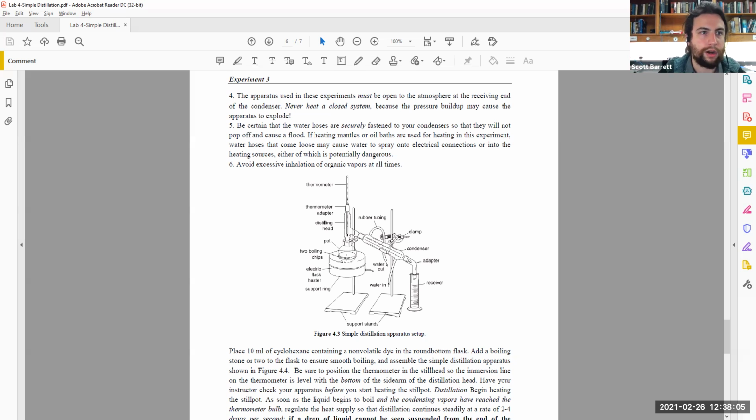So we will stick to our electric equipment. You'll have 2 boiling chips in here or a stir bar in order to allow boiling and surface area to coincide and have your heat completely homogeneous throughout your mixture. This will be your pot, or a round bottom flask is what we call in the lab. Here is your distilling head, or your adapter, as they call, but we define this as our distilling head because that is the head of the distillation device.